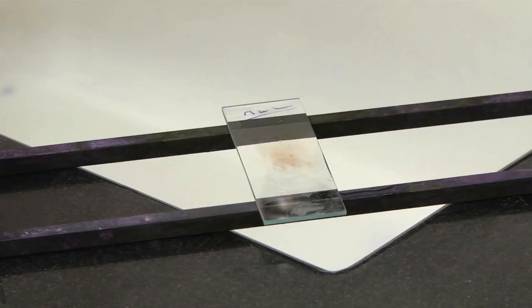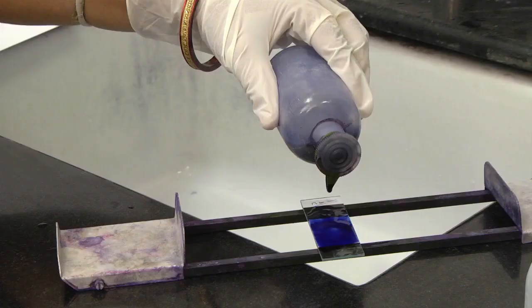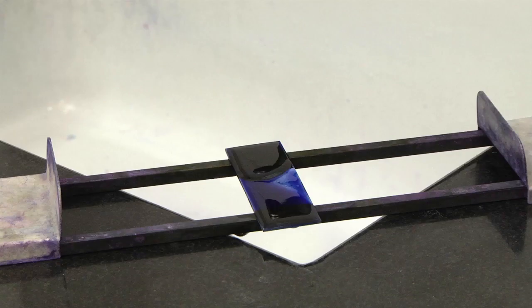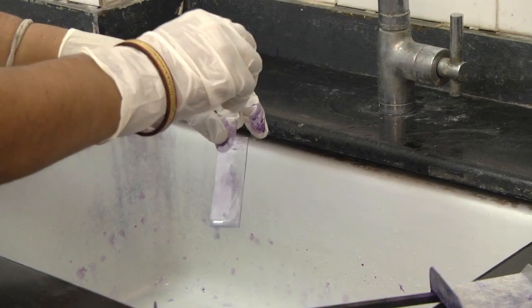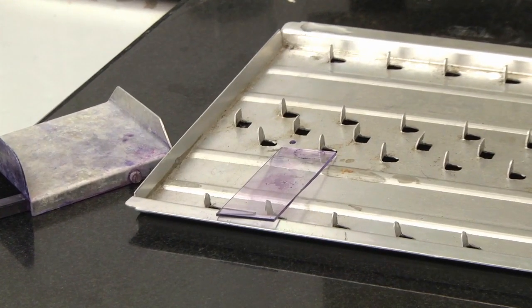After the smear dries, label the slide on the thick edge of the smear with another glass slide or a diamond marking pencil. This is done as the earlier markings can be washed away while staining. Add 7 to 8 drops of Giemsa stain. Let the stain stay on the slide for 20 to 30 minutes. Rinse gently for 3 minutes in a buffered water. Drain, dry, and examine.